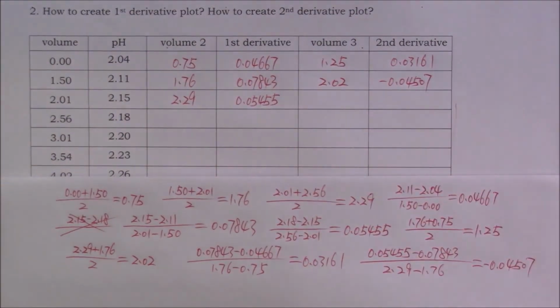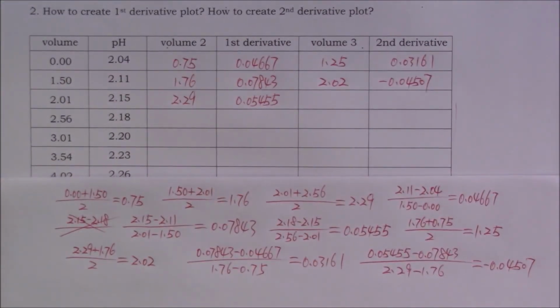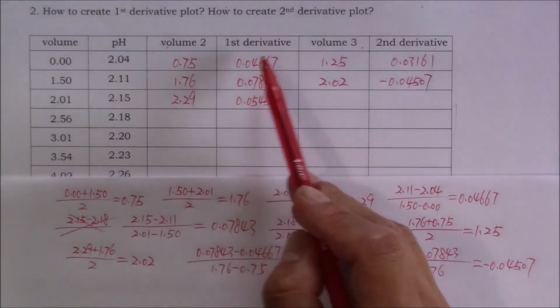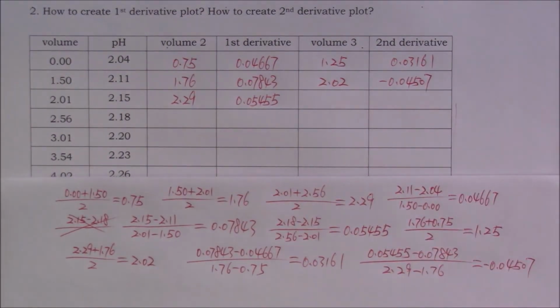Apparently, when you process your data, you are not going to manually calculate all the answers. You have to use Excel. After you put the formulas in the first row, you just drag it down. Then you will get all the answers. If you forget how to use Excel to do that, you can watch my previous video. I think I showed you how to do that.